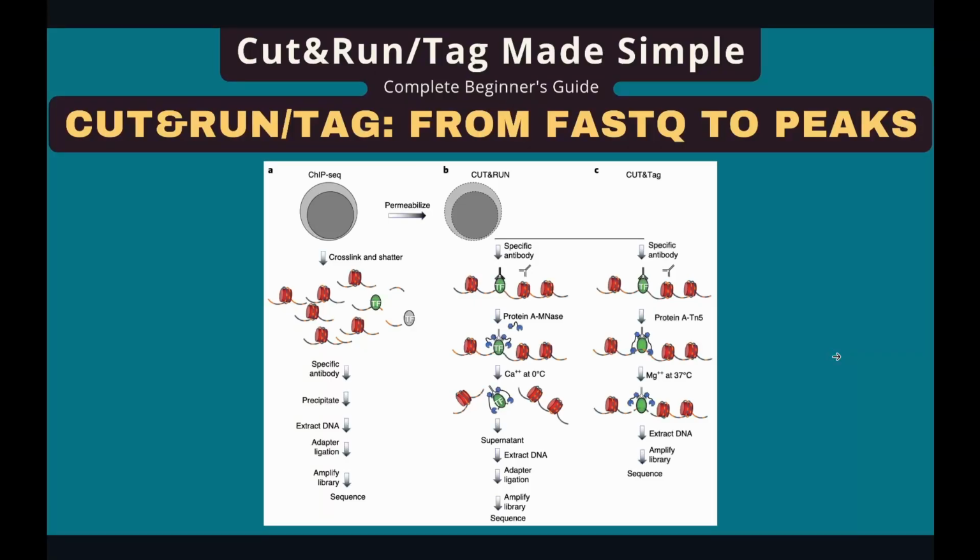In this video, I'm going to show you how to analyze CUT&RUN or CUT&Tag data. So what is CUT&RUN or CUT&Tag? Like ChIP-seq, they are technologies used to study DNA-protein interactions. They also require specific antibody binding. However, unlike ChIP-seq, CUT&RUN and CUT&Tag don't require cross-linking and random fragmentation.